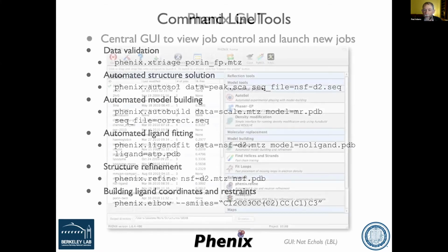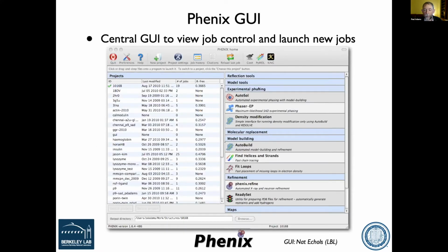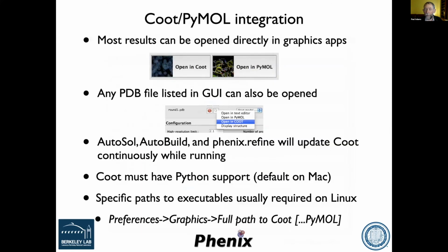I think a lot of people, myself included, tend to use the graphical interface because it's a nice way to interact with software. You've got a lot of information here, and we'll quickly look at this interface after I finish talking, just so everybody's familiar with it. And that's what we're going to use for the majority of what we're talking about today and tomorrow.